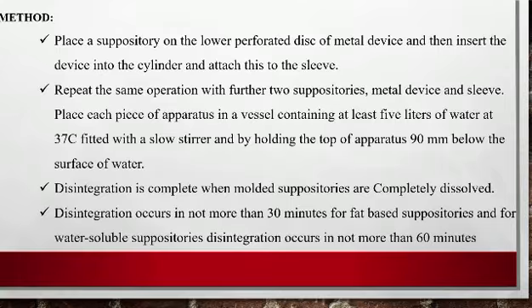We know the disintegration is completed when the suppositories are completely dissolved in the water. For fat suppositories, it should take not more than 30 minutes. For water soluble suppositories, the disintegration will take not more than 60 minutes.